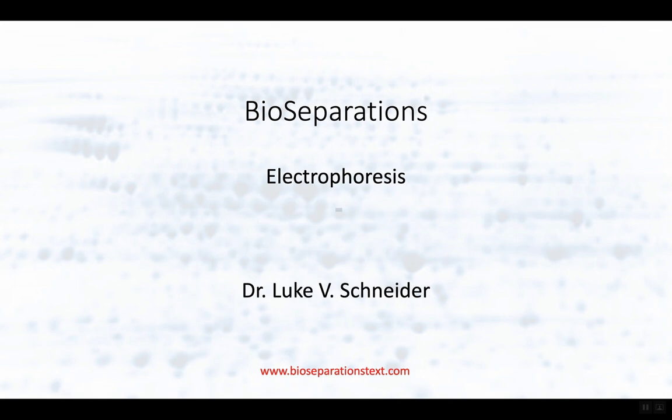There are multiple ways to run electrophoretic separations. But in this lecture we're going to talk more about how electrophoresis works. People tend not to understand this. They think of electrophoresis a lot like chromatography. It's not. It's actually the inverse of chromatography. And we'll discuss that in a second.